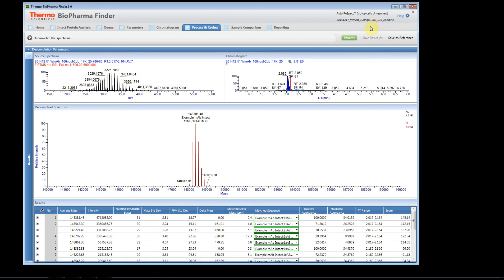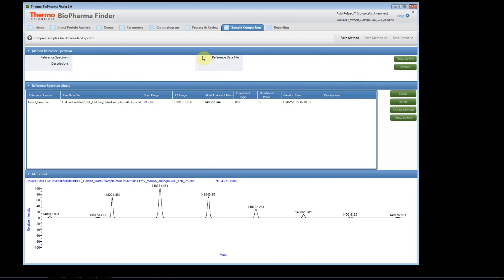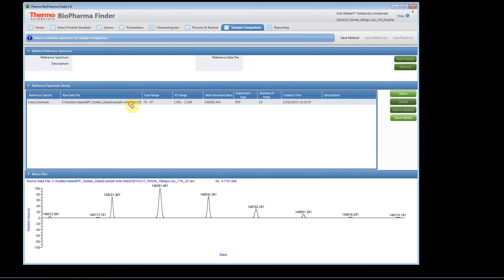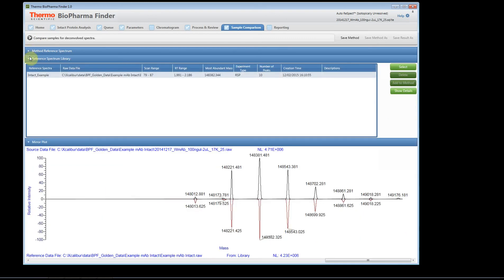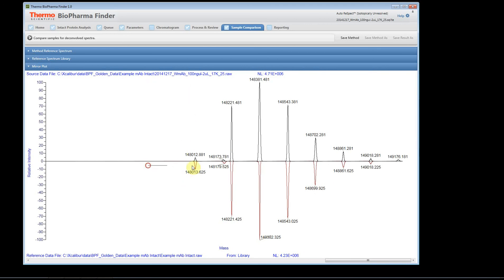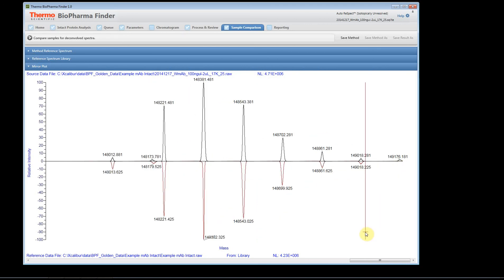Once both files complete, click to open the results. This is our second file, and now we can do a comparison. We select our reference file — the intact example we set earlier — click Select, and run the comparison. You can zoom in, hide panels for a better view, and see a side-by-side comparison between the two files. That's how to use the intact workflow with the ReSpect algorithm. Please see other examples for ReSpect with sliding window or the Extract algorithm.